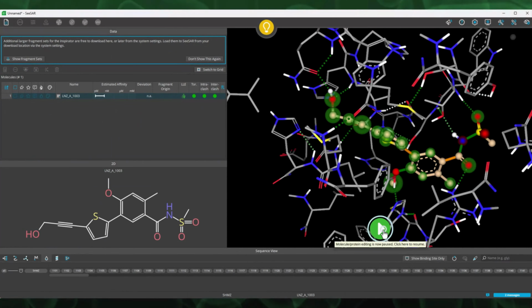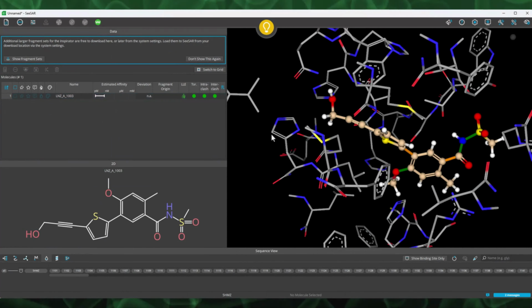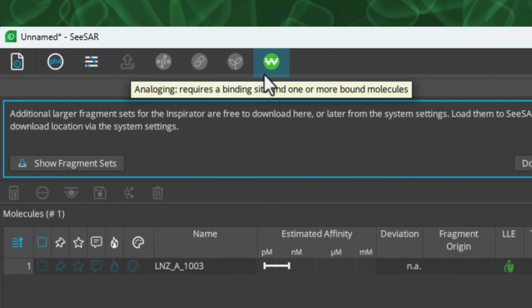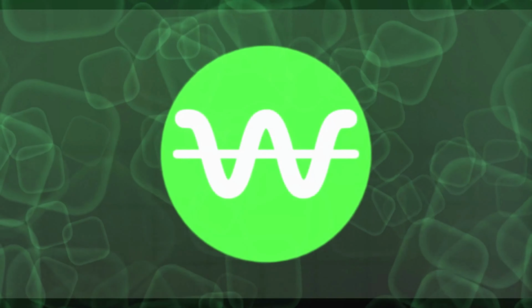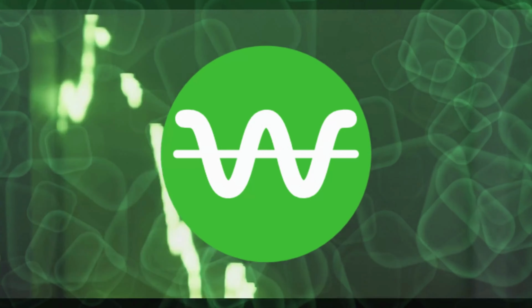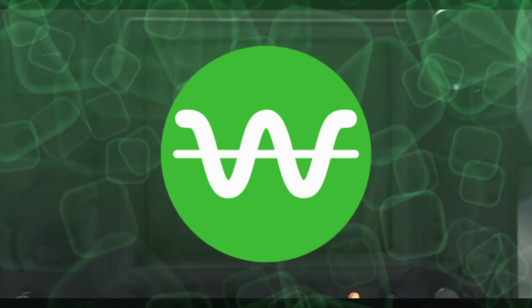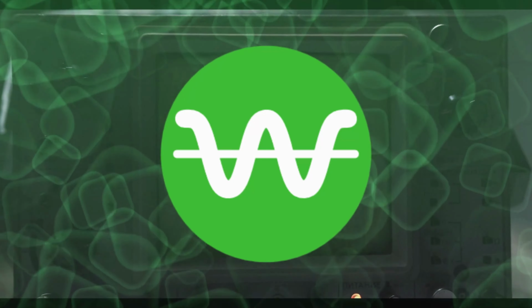Now, the generation of analogs for this molecule using MedChemesis simply requires one click on this green button up top. Before clicking, let us take a closer look at the button itself. The symbolism on this icon is rather abstract on purpose, indicative of the analog signal from electronics that hopefully helps you make the mental connection with analogging that MedChemesis facilitates.